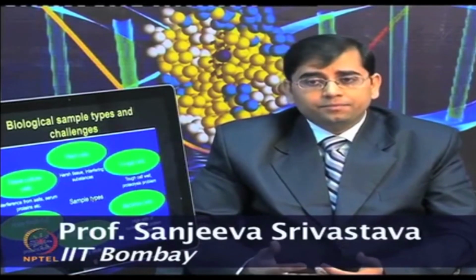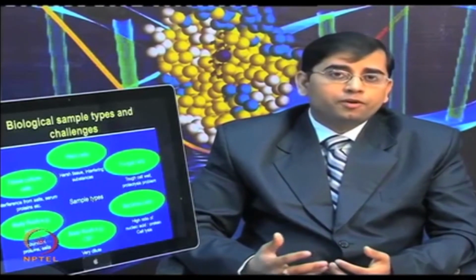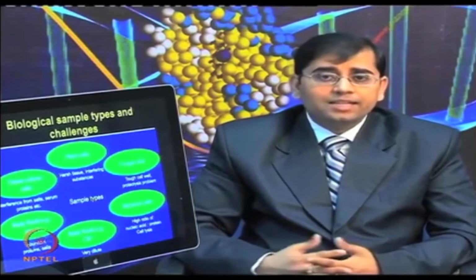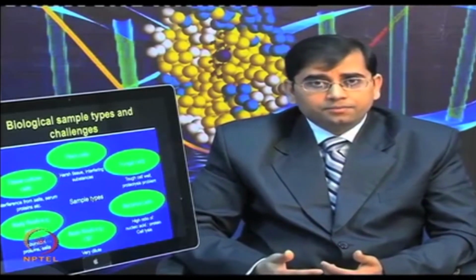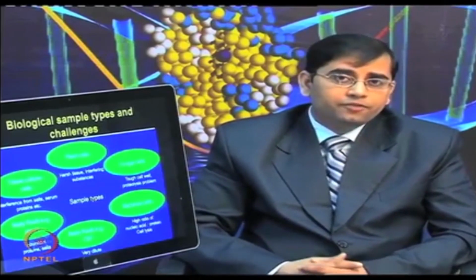The bacterial cells have a high ratio of nucleic acid to protein and cell lysis is also very tedious. Body fluids such as cerebrospinal fluid are very dilute. So, if you want to perform proteomic experiments on CSF, you need to concentrate your samples. Body fluids such as serum are very rich in abundant proteins as well as salt. So, you need to get rid of those abundant proteins such as serum albumin and remove the interfering salts.